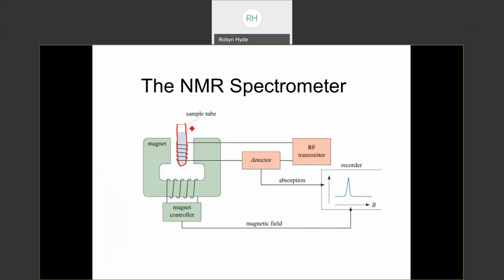There is a problem right here at the very beginning. Here's our problem. Let's say our unknown is something like this, and I need to dissolve it. Well, this 1, 2, 3, 4, I have branching.